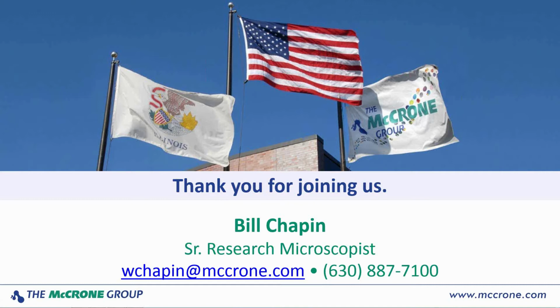Linda says, how do you deal with static and keeping samples from jumping away? You pray a lot. There's a gun that you can buy called a Zero-Stat. There are also some other tools. If I get particles in a plastic bag or in a Petri dish, sometimes I will zap it with that. Sometimes you have to resort to using a little bit of liquid, a little water or something like that, in order to stabilize the particle.